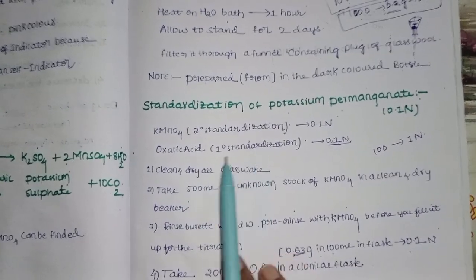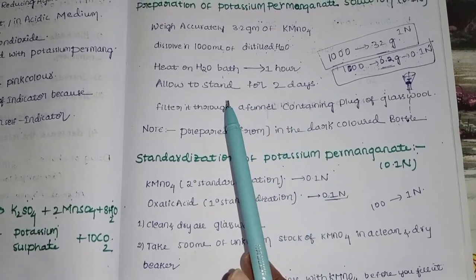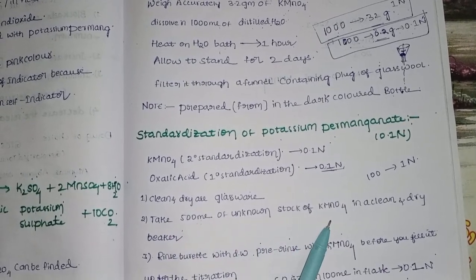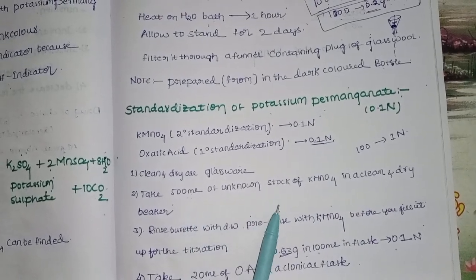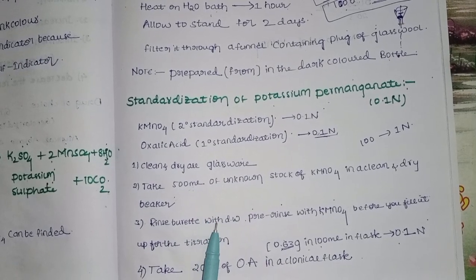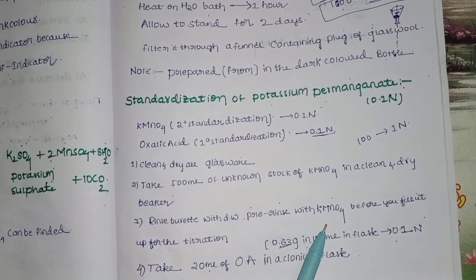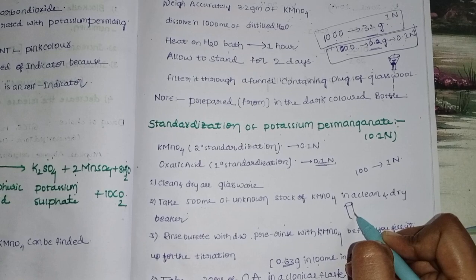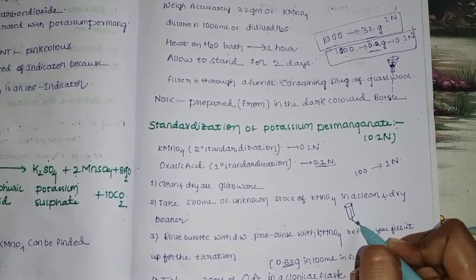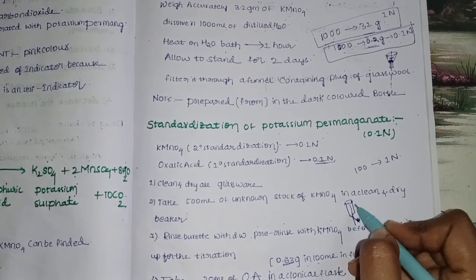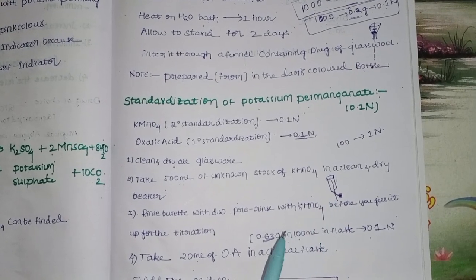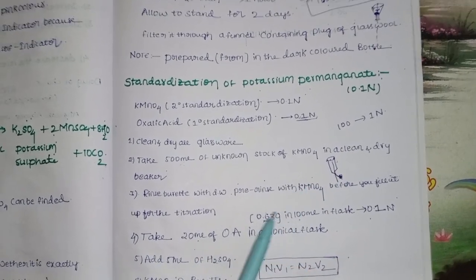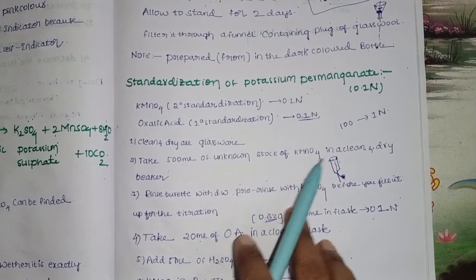Clean and dry all glassware. Take 500 ml of the unknown stock solution of KMnO4 in a clean and dry beaker. Rinse the burette first with distilled water, then rinse the burette with KMnO4 solution, and fill the burette with KMnO4.